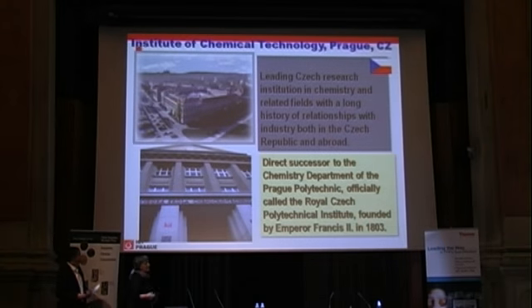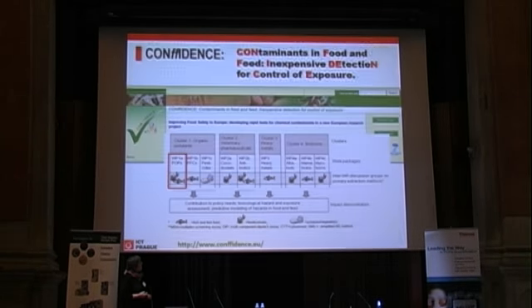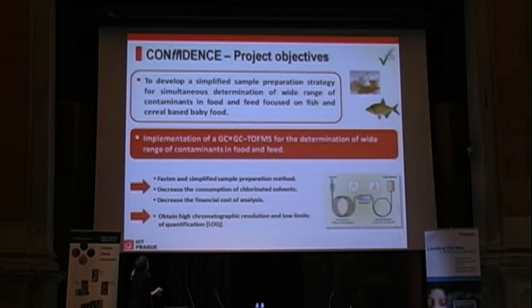So my institute is in Prague, a very old institution, and a lot of projects, as Michal mentioned, but also a lot of instrumentation for our work. And now I'm going to introduce you to our 6 years old effort to integrate analysis of multiple contaminants into a single procedure. It was within the frame of the Confidence project, and the work package I want to introduce was the POPs work package, and as you will see, there were many compounds and many efforts to improve it.